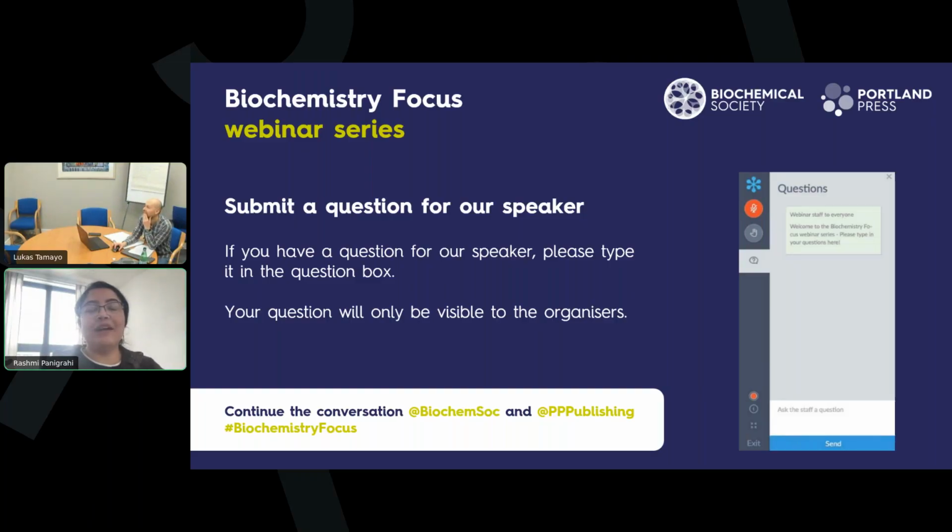So, I would like to predict, but unfortunately, with this project, we could not predict anything. Everything was unpredictable because we wanted to see the BRCT bound to the phosphorylated tail on the nucleosome. That is the structure we expected, but what happened is completely different. We did experiments after experiments, both in silico, went back to theory and studied more, and then made a conclusion and figured out that the BRCT can never bind to the nucleosome on the disk, except through the phosphorylation.